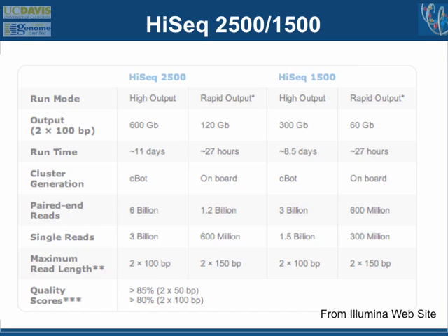And for sequencing a genome, if you get 200-fold coverage of the genome, that is, on average, each piece of the genome has been read 200 times, you can now make up for the errors by having depth of coverage for particular regions of the genome. That only works if the error frequency is random. So if the sequencing method is highly biased, you will get the same error over and over and over again, no matter what your coverage in a particular region.